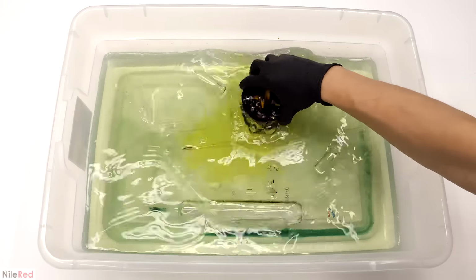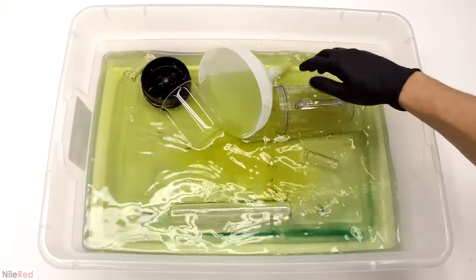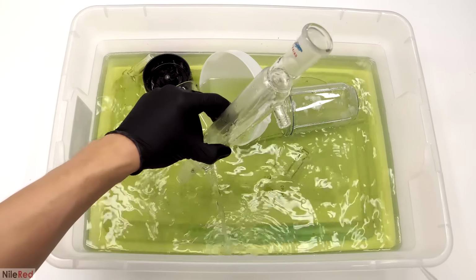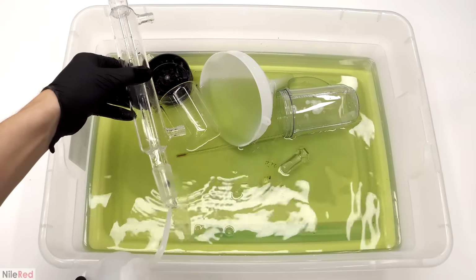Pretty much everything that I used in this project was put into this bath at some point, and I let it soak until I didn't see any of the red color. Then after that, I could take the piece out and rinse it with a bunch of water to get rid of any chromium ions that might still remain.